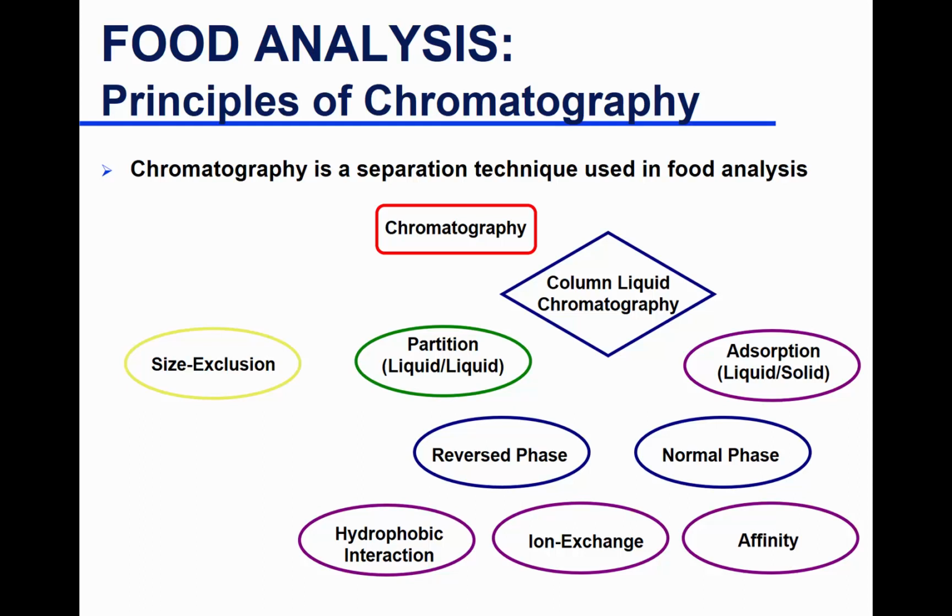They're all different forms of adsorption, adsorbing onto the stationary phase. They adsorb via different mechanisms. They either adsorb via electrostatic interaction, ionic interaction, or based on polarity and their liking or disliking of polar substances, or very specific interactions as in affinity, or very hydrophobic interactions as in hydrophobic interaction chromatography. So it's all adsorptive, adsorbing onto a surface.